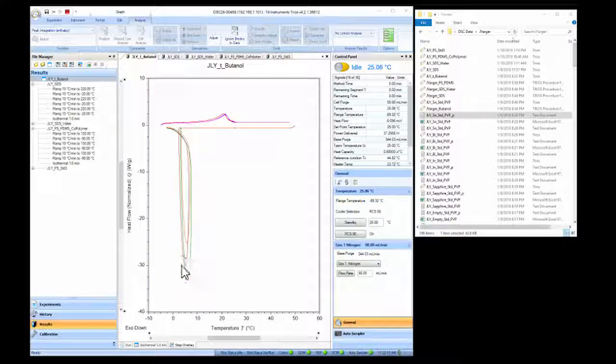And this highlights one of the things, which is that you rarely look at DSC upon cooling. You almost always use the heating scan, but it shows both of them. It's because as soon as it starts to freeze, because of the heat being released from the crystallization process, you can see it actually start warming up the sample and then finally go back. So generally, we only plot these right here.